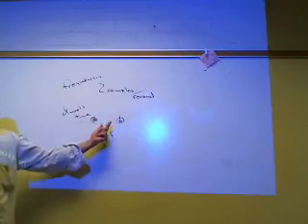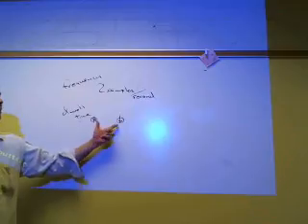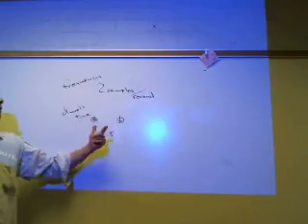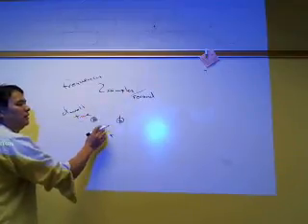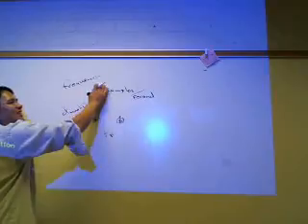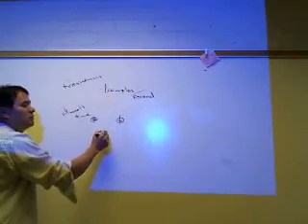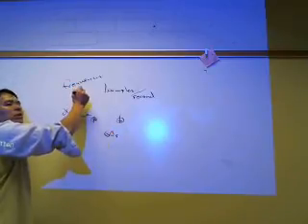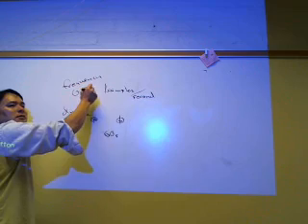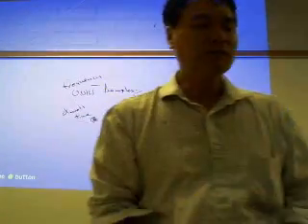We can set the dwell time to collect every half a second. Every half a second means we collect 2 samples a second, right? What if we set the dwell time to 1 second? Then how many samples would we collect? 1 sample per second. Let's say we set the dwell time to 60 seconds. Then how many samples per second? It should come out to 0.0166, right?